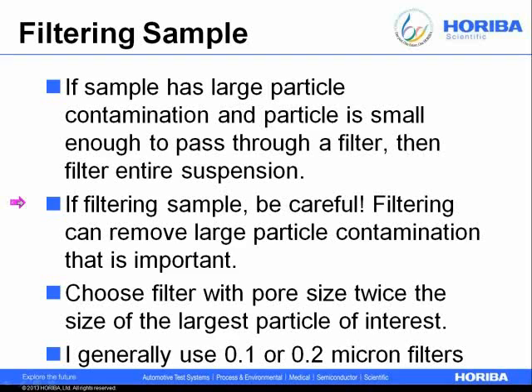If you do decide to filter a sample, be a bit careful. Filtering can remove large particle contamination that is important. You can imagine, if someone brings you a bucket of stuff and they want to know the size, before you filter out the large stuff, figure out if the large stuff is really relevant to your results. Try and choose a filter with a pore size twice the size of the large particle of interest.